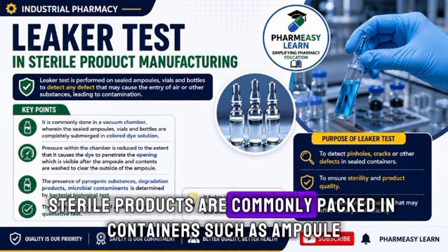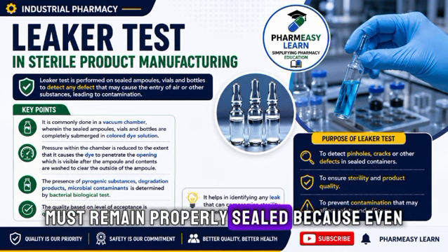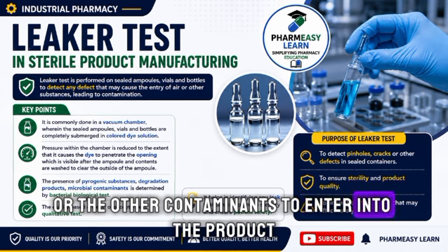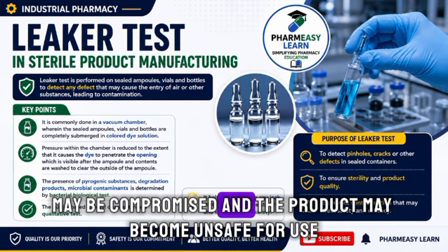Sterile products are commonly packed in containers such as ampoules, vials, and bottles. These containers must remain properly sealed because even a very small defect can allow microorganisms or other contaminants to enter into the product. If contamination enters a sterile product, its sterility may be compromised and the product may become unsafe for use.